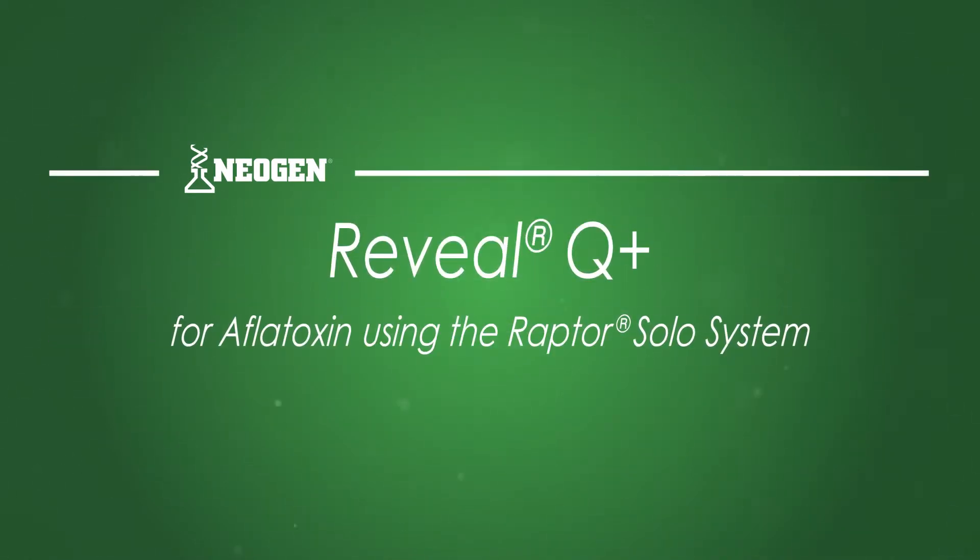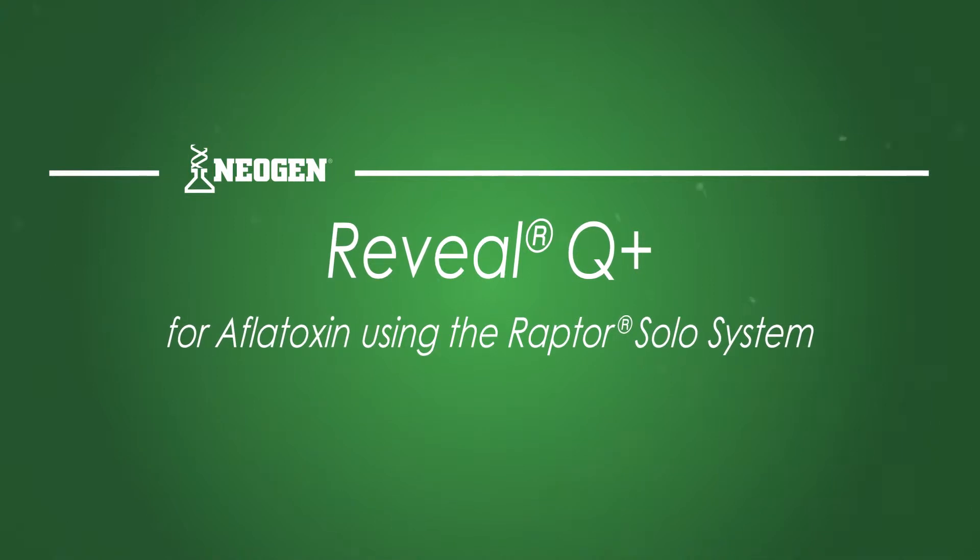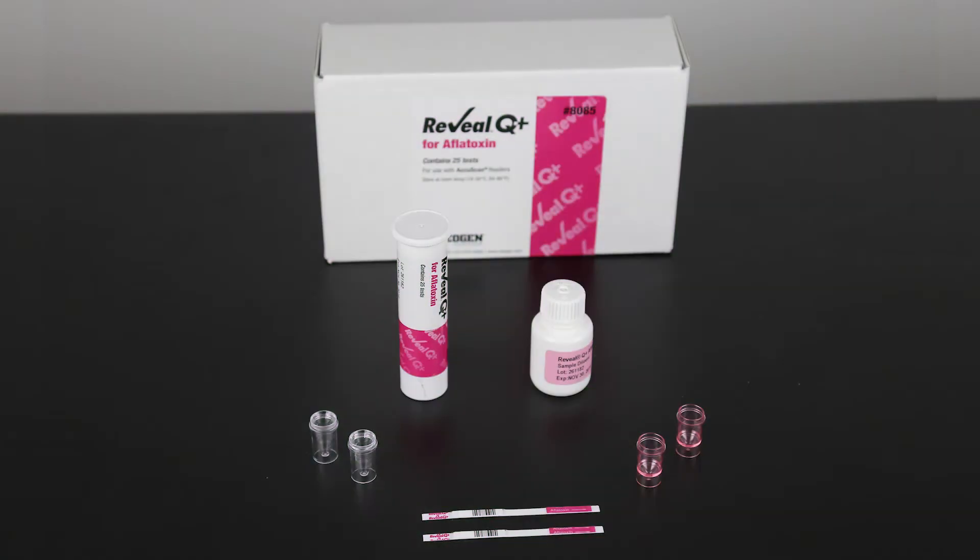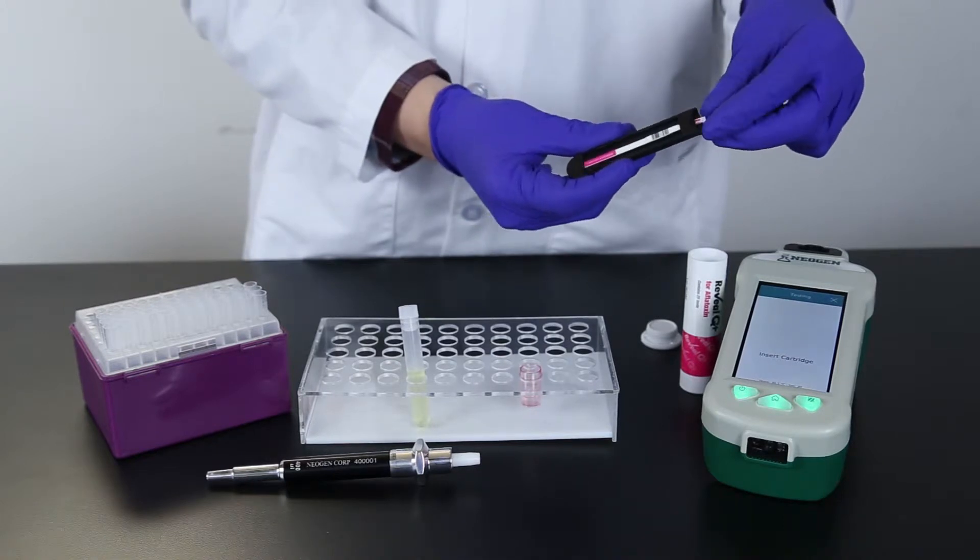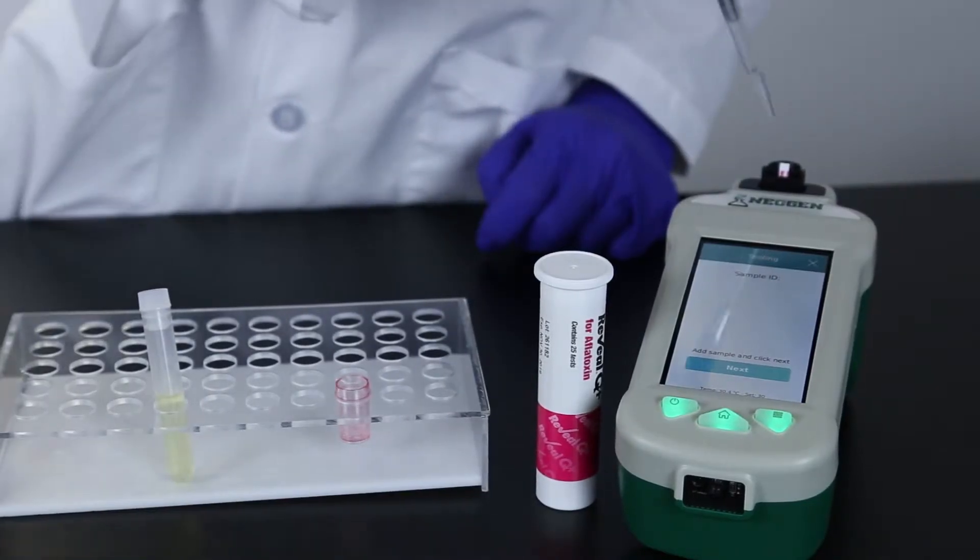In this video, we'll look at everything you need to know to run Reveal Q Plus for Aflatoxin using the Raptor Solo system. The Raptor system allows you to add sample and walk away. It's that simple.